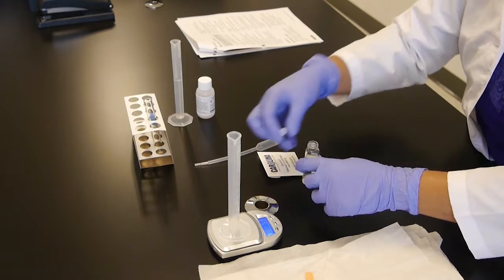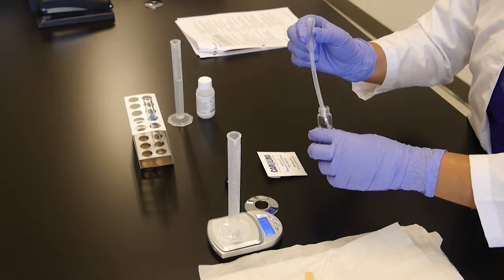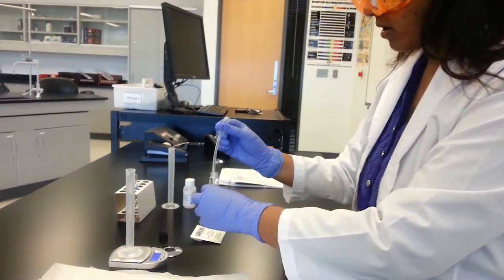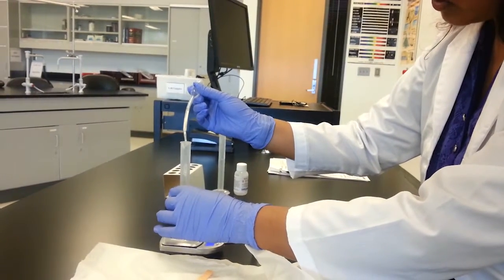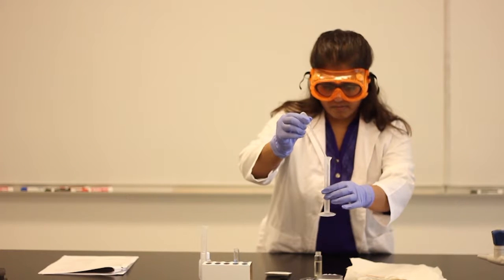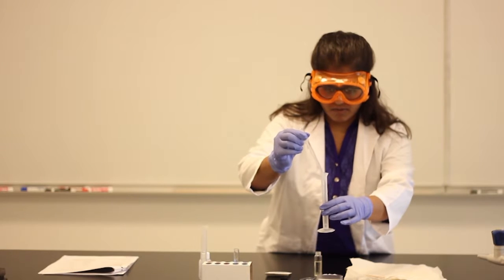So let's take about 1 ml of the biodiesel. Biodiesel will be the top liquid layer. So let's do this. About 1 ml. There you go.